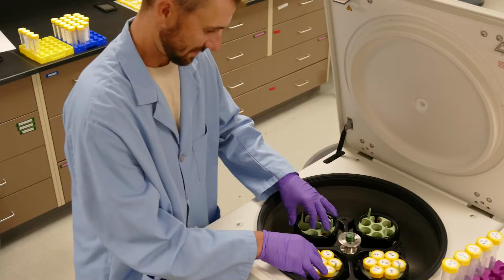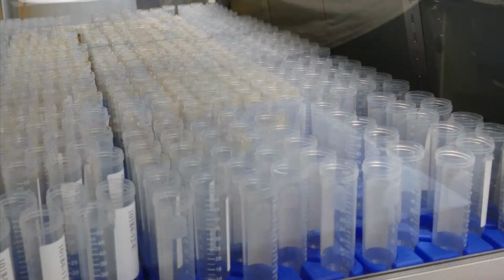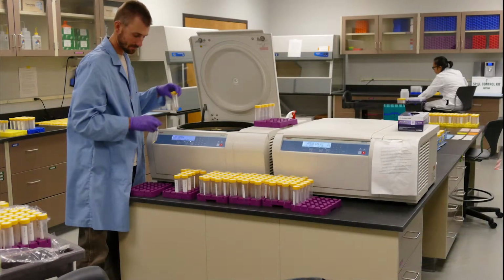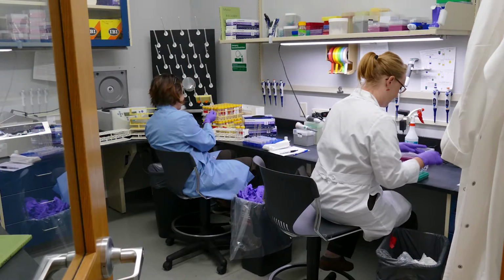Before we get started, it is always important to practice good laboratory practices, which at this stage in eDNA processing requires sterilization of the equipment and workspace, changing gloves at the completion of each step in the process and if contamination is ever suspected, and clean gloves should be used if keyboards, pens, notebooks, etc. are handled. Additionally, different lab coats are worn in each lab area where open tubes are processed to further prevent cross-contamination.